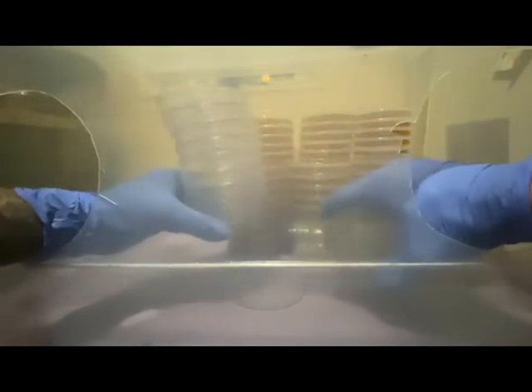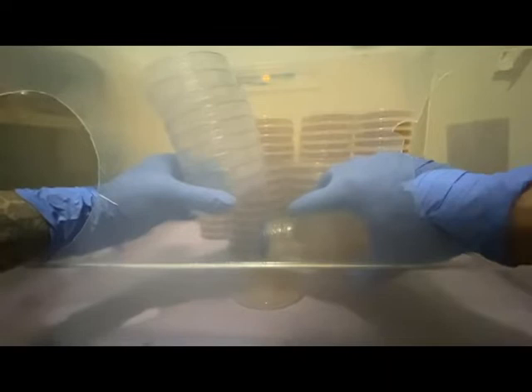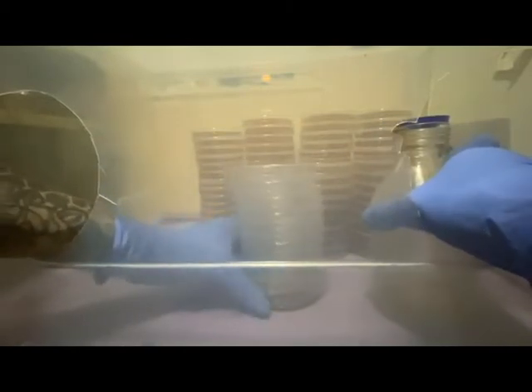But I keep all my stuff aside for at least 2 weeks. Well, 2 weeks is pushing it. I started out doing 2 weeks, but I hold them aside for at least a week. They usually say about 72 hours. If you don't see contamination in your newly poured plates within 72 hours, it's a general good rule of thumb that they'll be okay.